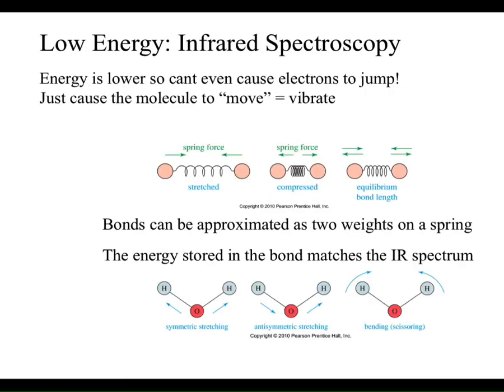So the next part is infrared spectroscopy, which is the primary reason for this video. Infrared energy is lower in energy, and so it can't cause the electrons to jump around. Instead, it just causes the molecule to move or vibrate.